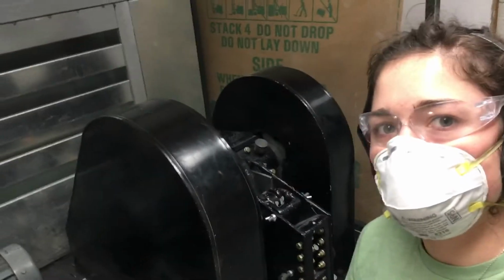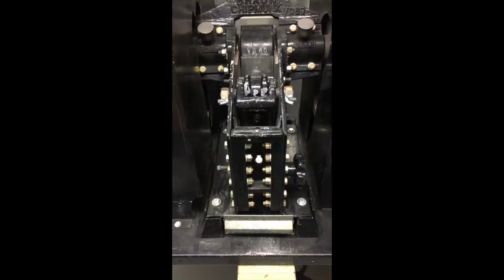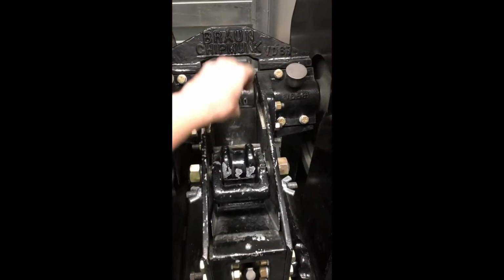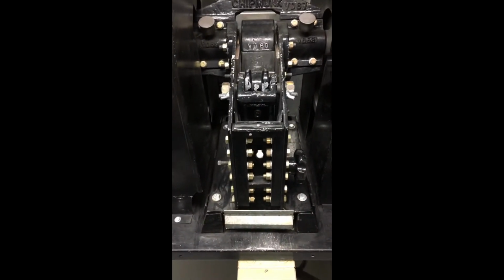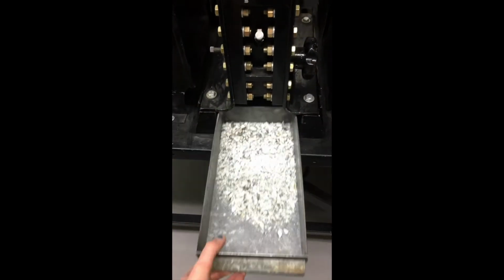Now that my work area is clean and prepped, I will start the rock crushing process by running my rocks through the jaw crusher. The jaw crusher works by dropping a rock in the top, letting the jaws do their work, and we get crushed rocks out the bottom.